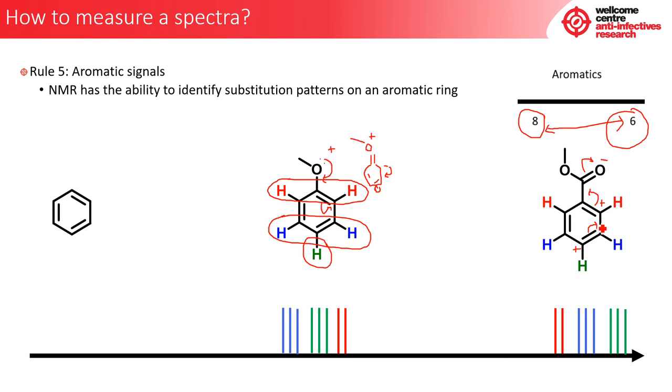However, the electron density is poor at these regions in comparison to its electron donating species where they were rich. The sites therefore that are most affected are the ortho and the para. Because the ortho is in closer proximity to the carbonyl group, it appears higher up. Whereas you would find actually the blue and the green protons, these groups would actually be quite close together, and here I've just drawn them blue followed by green, but they could be highly close together or even maybe merge or overlap with one another. So let's take a look at some more.